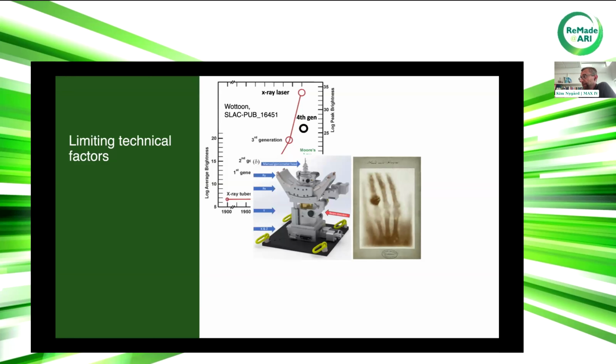Then another limitation is that these scans tend to become rather large. You have a small beam, you want to cover a large area. Besides the many photons that you get at a synchrotron, you also need very fast detectors, much faster than what Röntgen used 120 something years ago to image his wife's hand. Today, we typically run these experiments at 100 Hertz or faster.